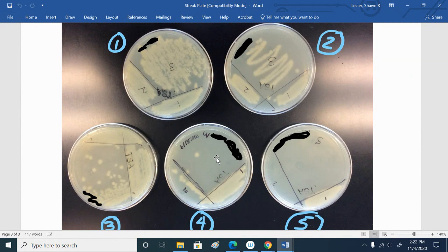They don't have multiple colonies. And it also looks like they just did 1 pull from zone 1 and 1 pull from zone 2, and that was not enough, right? So we normally recommend you go into the previous zone at least 3 or 4 times to grab enough bacteria to separate. And what about plate 5?